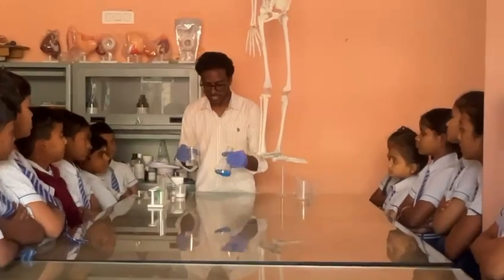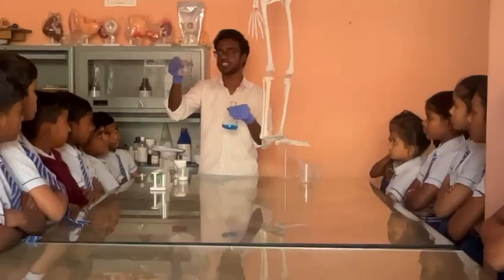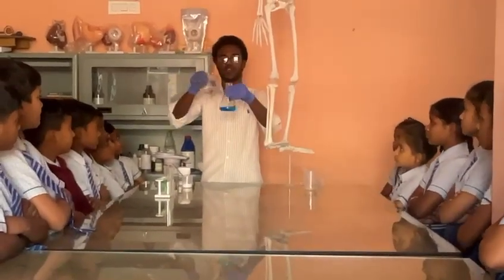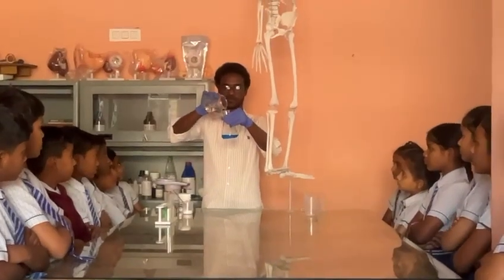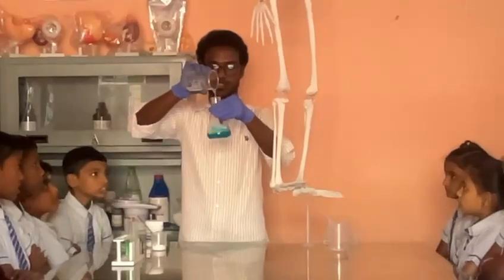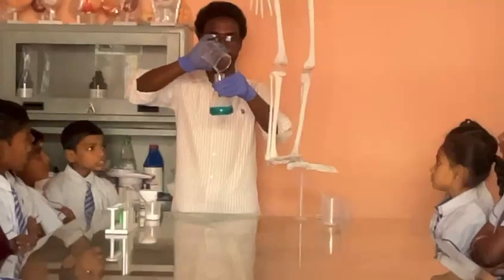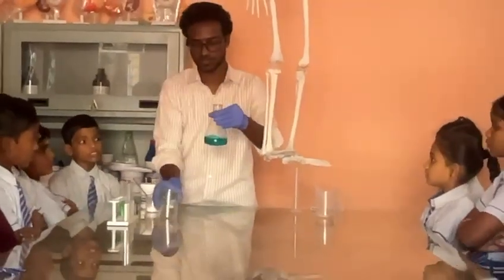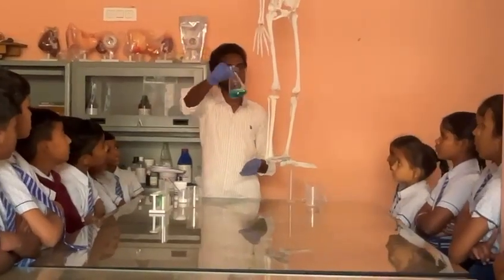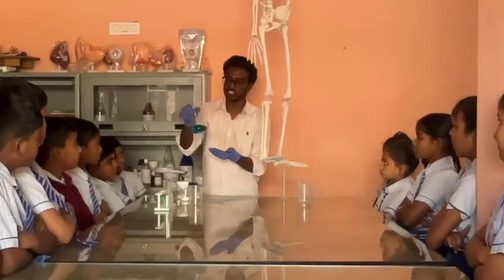Now if you see, this is blue copper sulfate solution, and here we have NaCl solution, which is aqueous, water color, right? Now if I mix this with this, can you see the change? Yes, sir. Now the color has completely changed. It has become green, right? Why has this color change taken place?